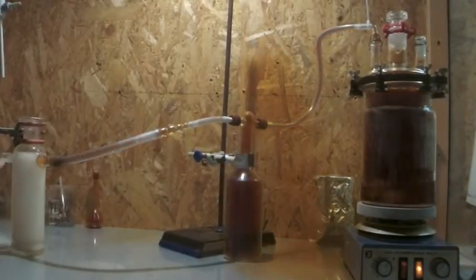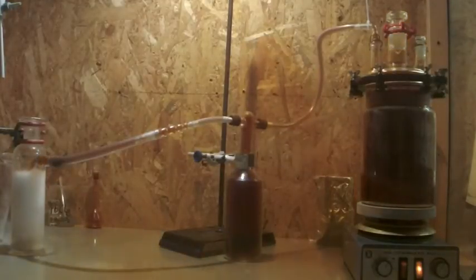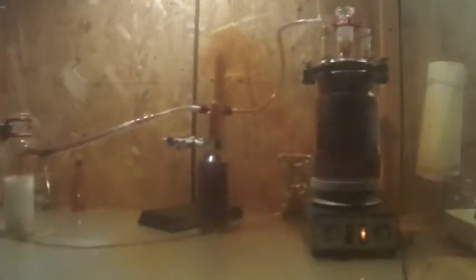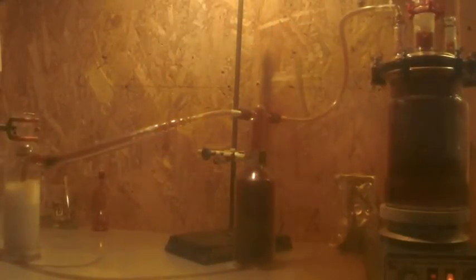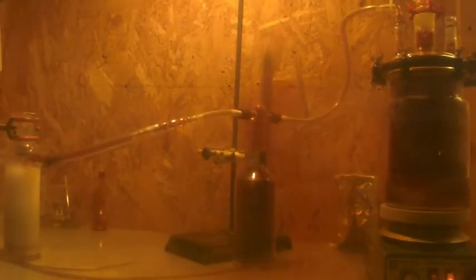This was not the first time my attempt to recollect the nitrogen oxides failed. Now after two glorious fails with this reaction, my fume hood is broken. But I learned my lesson. Next time I am trying to condense the NOx instead of dissolving them in water or a hydroxide solution. Because my exhaust system was corroded and totally killed by the nitrogen oxides, the fumes took a very long time getting out of the fume hood.